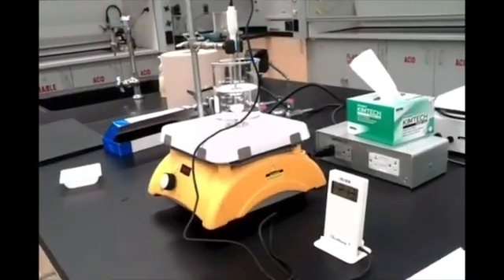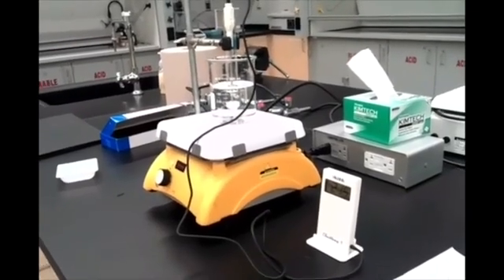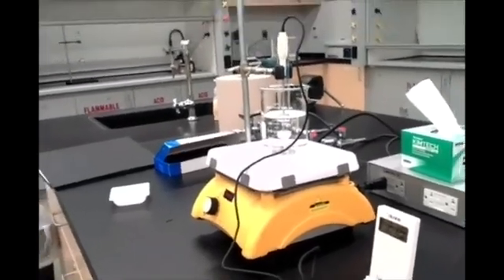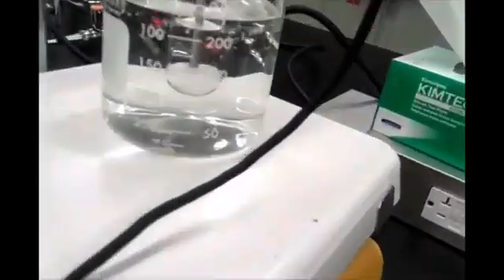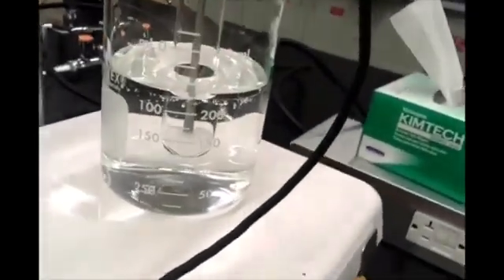All right, so here you can see our setup for this experiment. I've got a hot plate with a hot water bath sitting here. Basically we're going to take our potassium nitrate. As you can see, it's over there in that test tube still with our 5 milliliters of water.